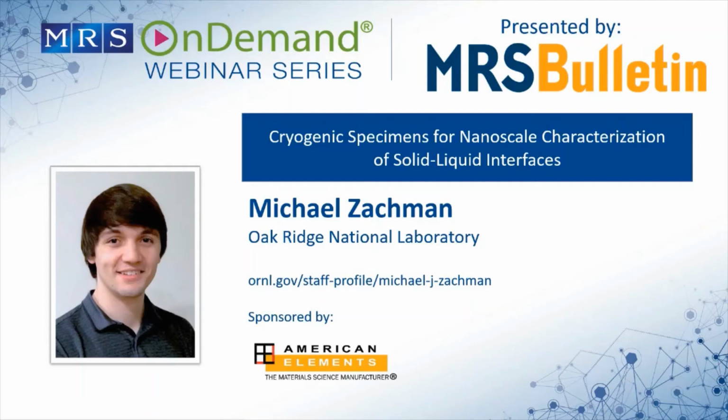or peroxide or something, it converts to lithium oxide. And after that, lithium oxide is stable and you just get mass loss over time. So if any of you are looking at lithium materials, just know that if you're looking at lithium hydroxide or peroxide, it could potentially change to something else under the beam. But lithium hydride and lithium are actually pretty stable under the beam at cryogenic temperatures, and so those can go up to 10 to the 5 or more before they really start losing much mass. They don't ever change their bonding structure, really.